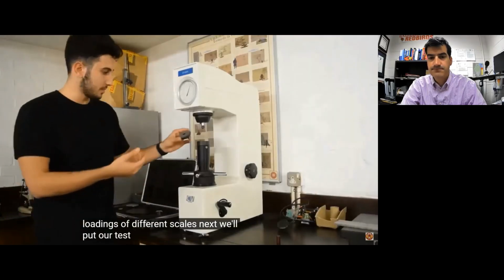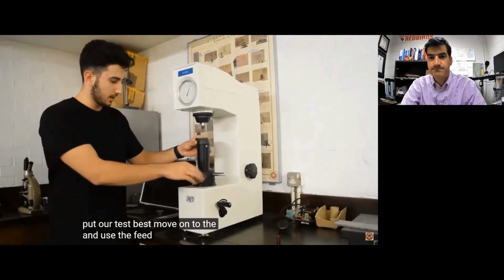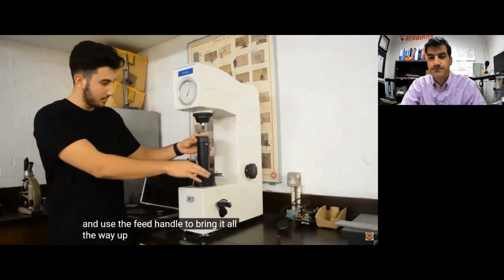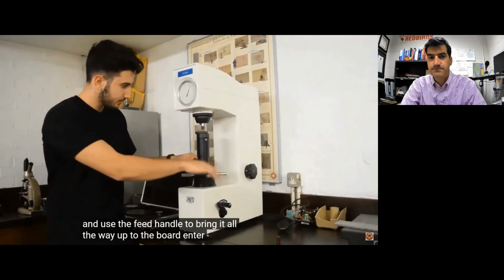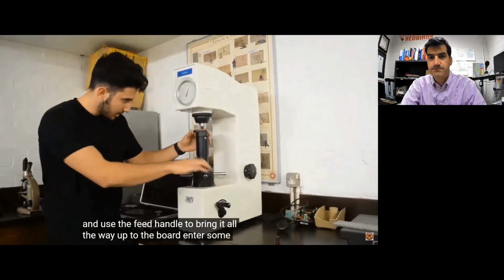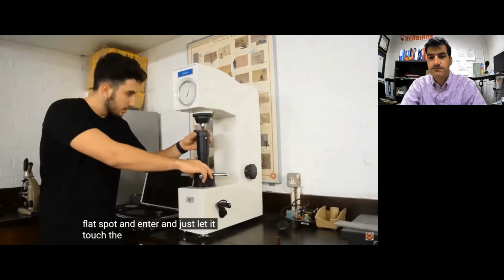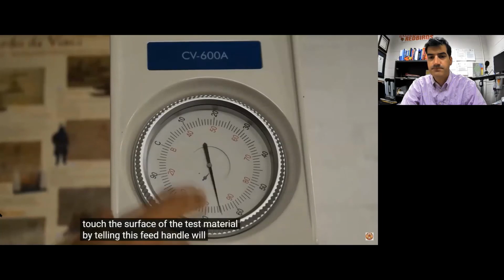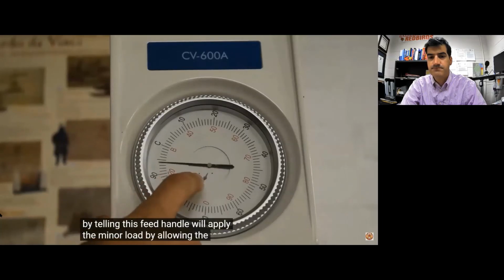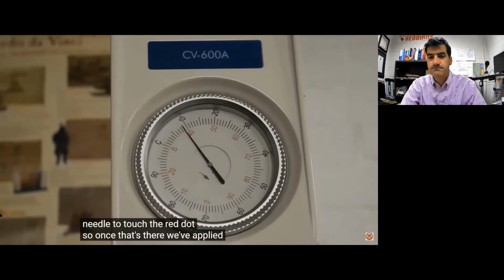Next, we'll put our test specimen onto the bench and use the feed handle to bring it all the way up to the ball indenter. Find a nice flat spot on the specimen and just let the indenter touch the surface of the test material. By turning this feed handle, we'll apply the minor load by allowing the small needle to touch the red dot. So once that's there, we've applied the minor load.